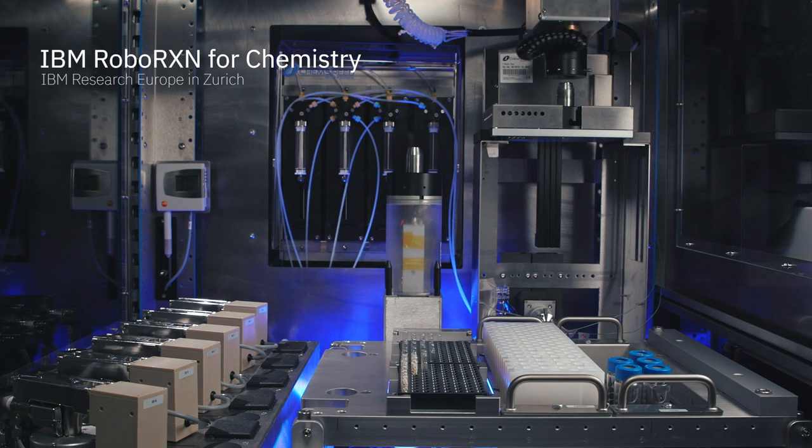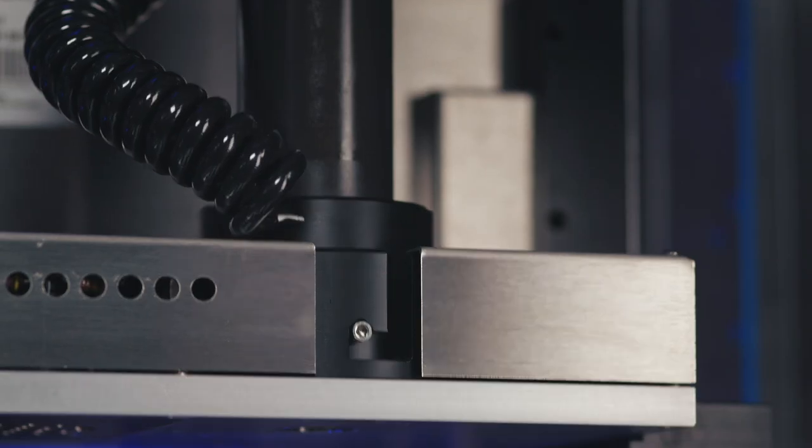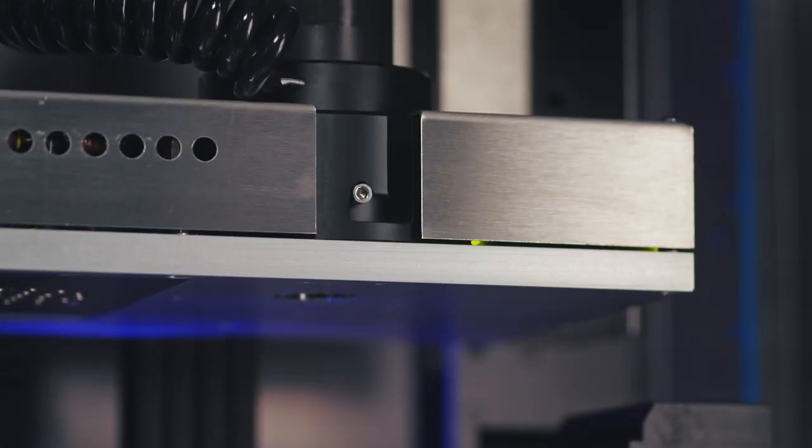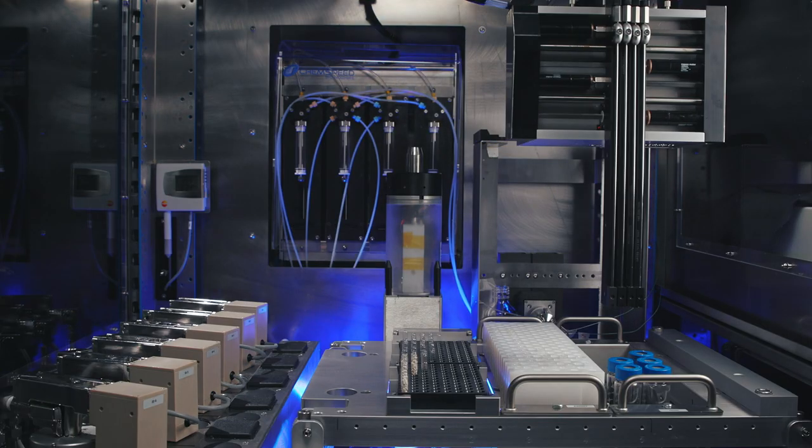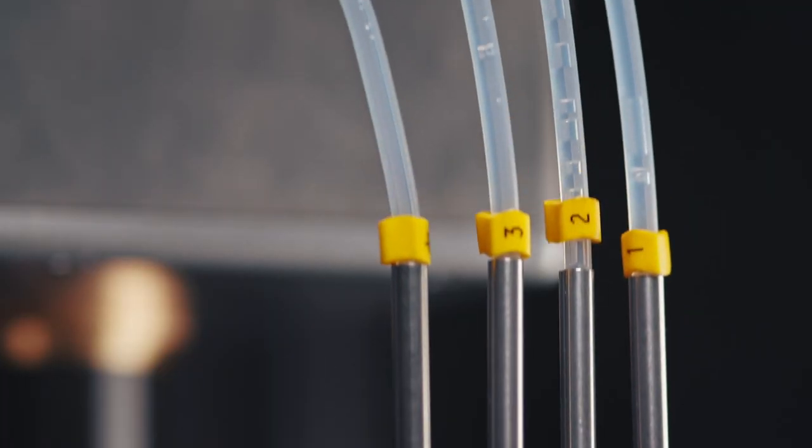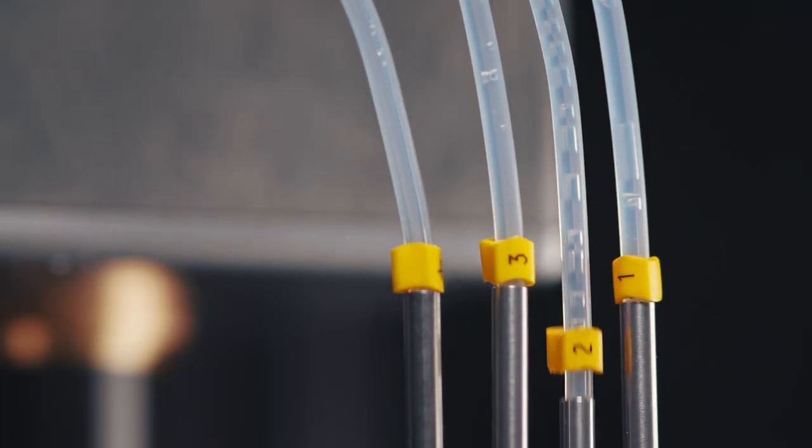RoboRxN is a pioneering project that shows how the combination of three technologies—cloud, AI, and automation—can dramatically change the way we work.